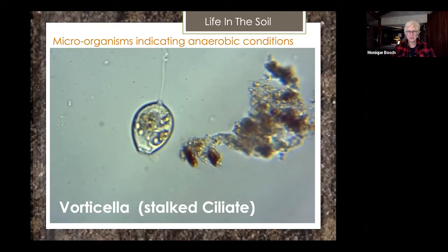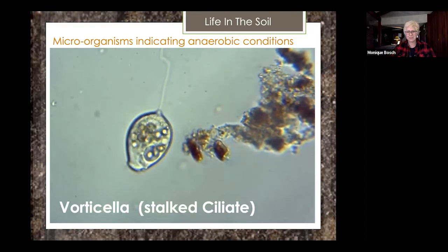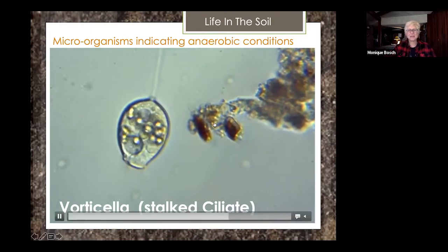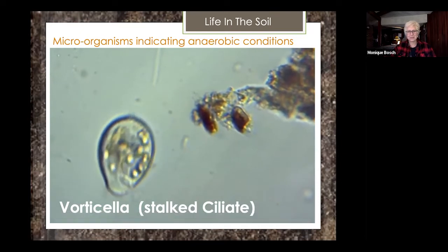He should let go of it, start rotating around. There he is. He didn't like whatever he ate there. But it really does remind me of the incredible life that is going on in this soil. I mean, we're zoomed in 200 times.